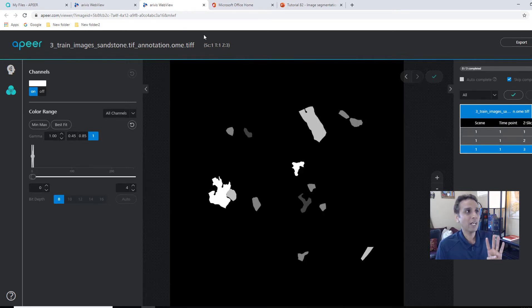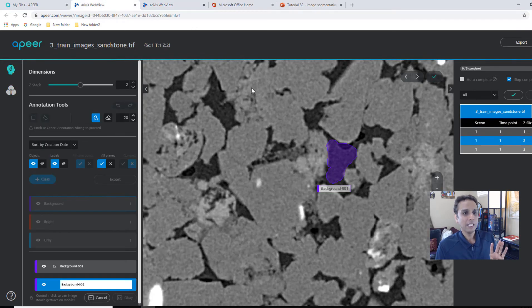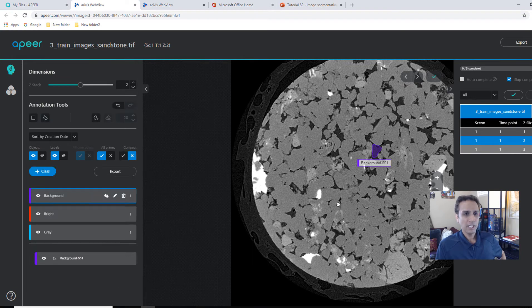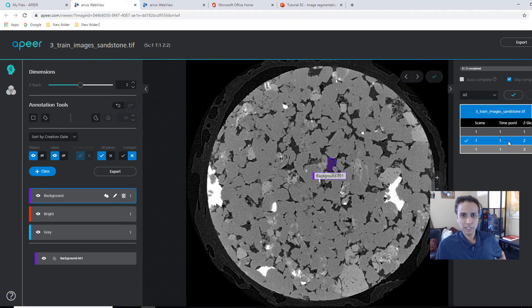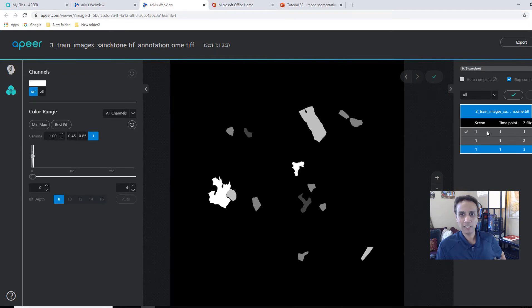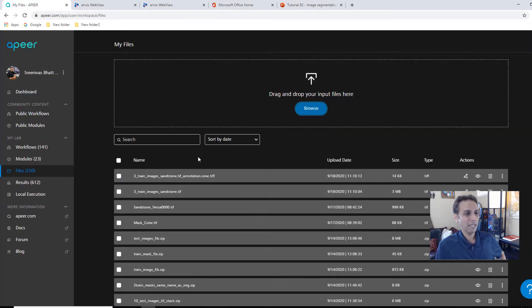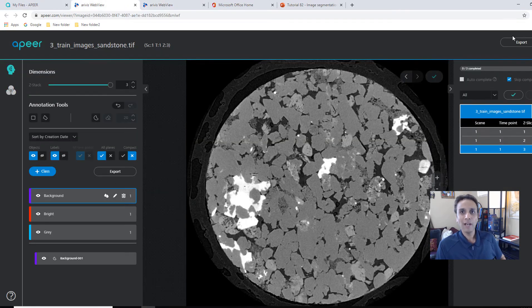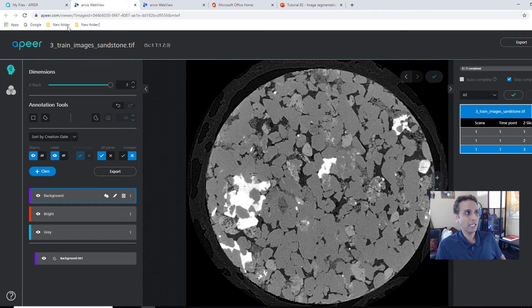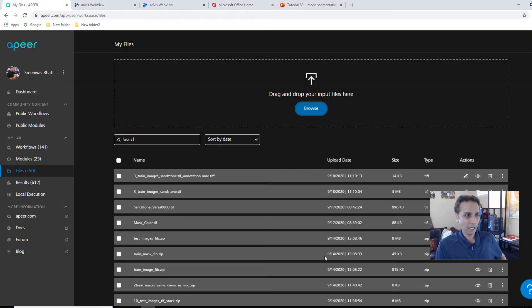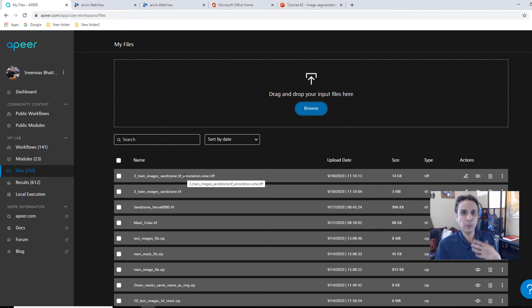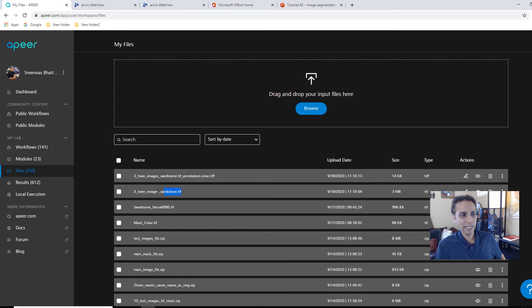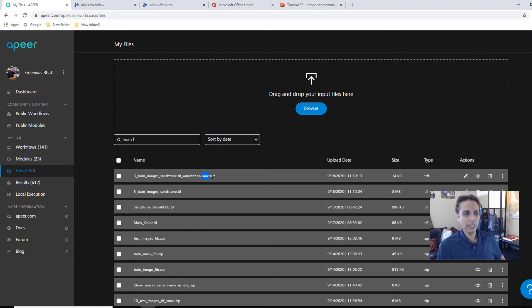So if you open the right hand side, I can go to the next image. Now there you go. That's the next image. And I can just do my background or pores on the next image and I can just paint this region. Once you're done painting all of these regions, then you just click on export and then export annotation as image for this segmentation purpose, export it as binary mask and select all the classes you would like to export and then download. So the image, when you do that, it looks somewhat like this. These are the regions I annotated. This is from my slice one in this TIFF stack, slice two, slice three.